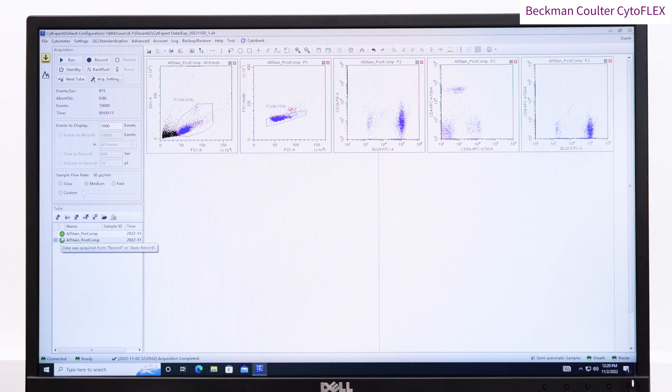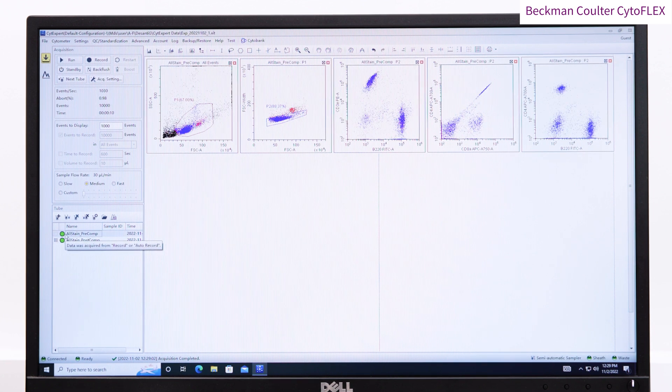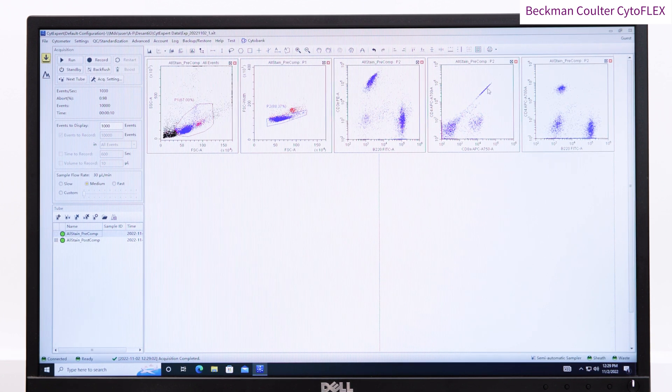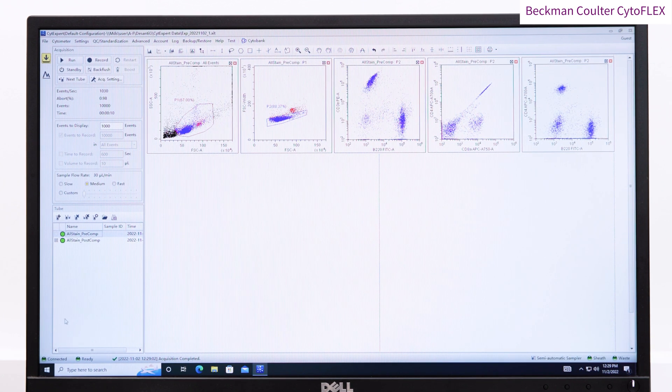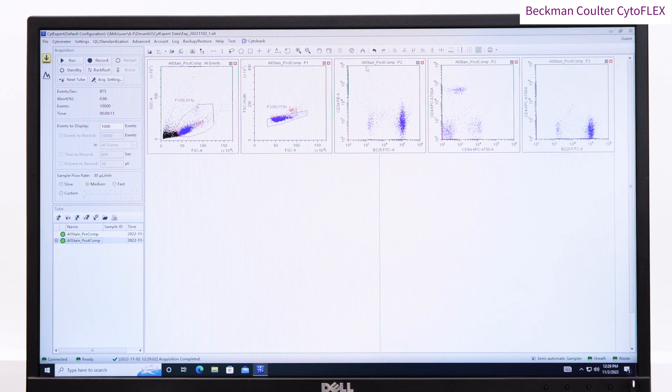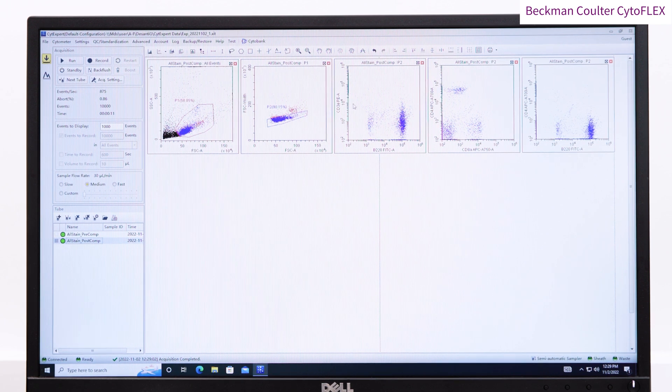However, in this example, you can see some of the data is squashed along the axis. It looks like we have some overcompensation.